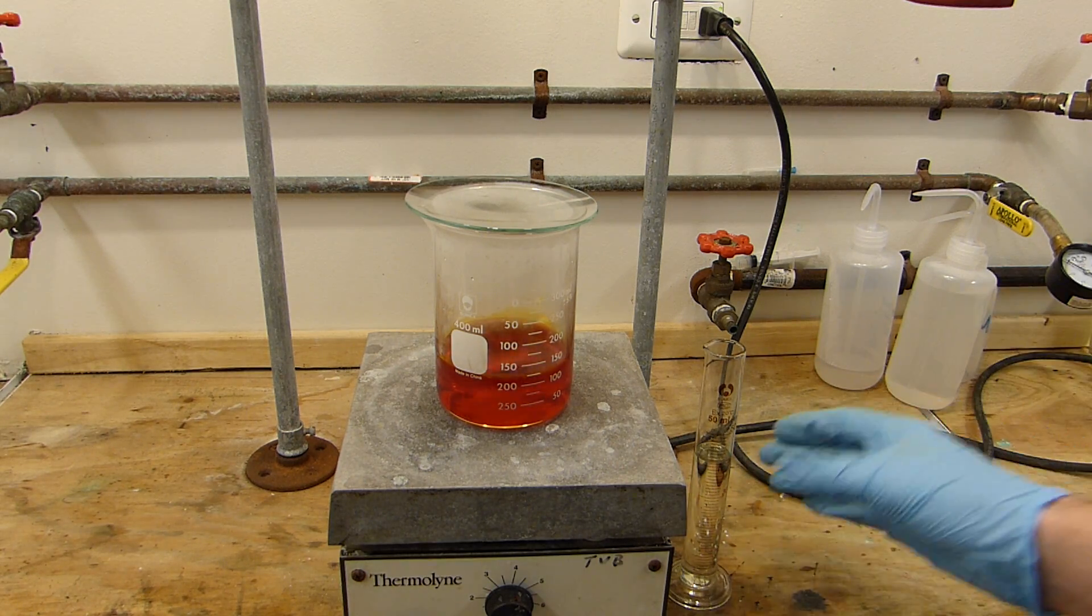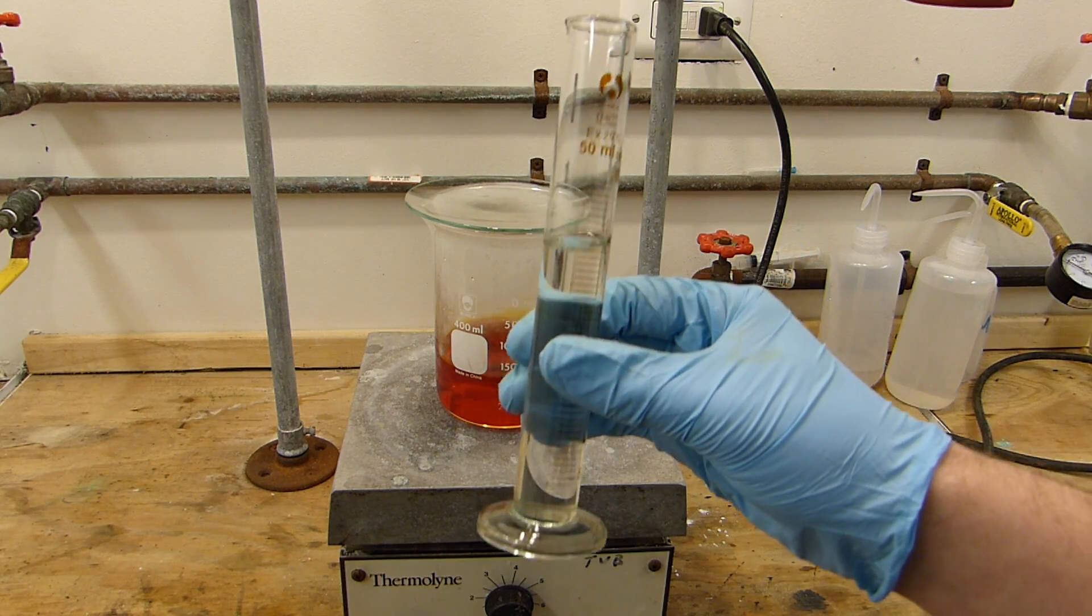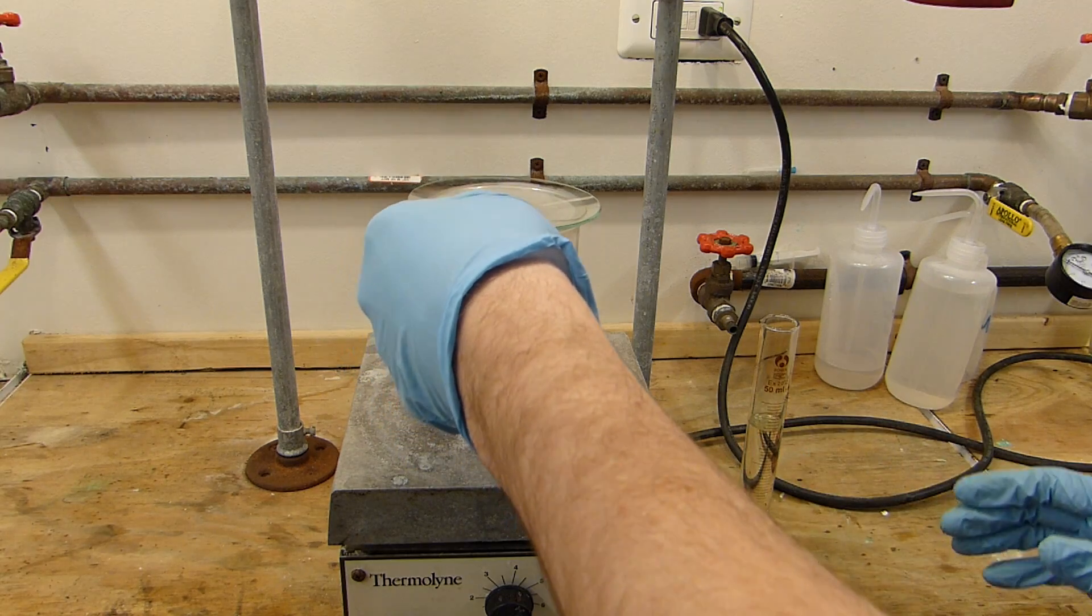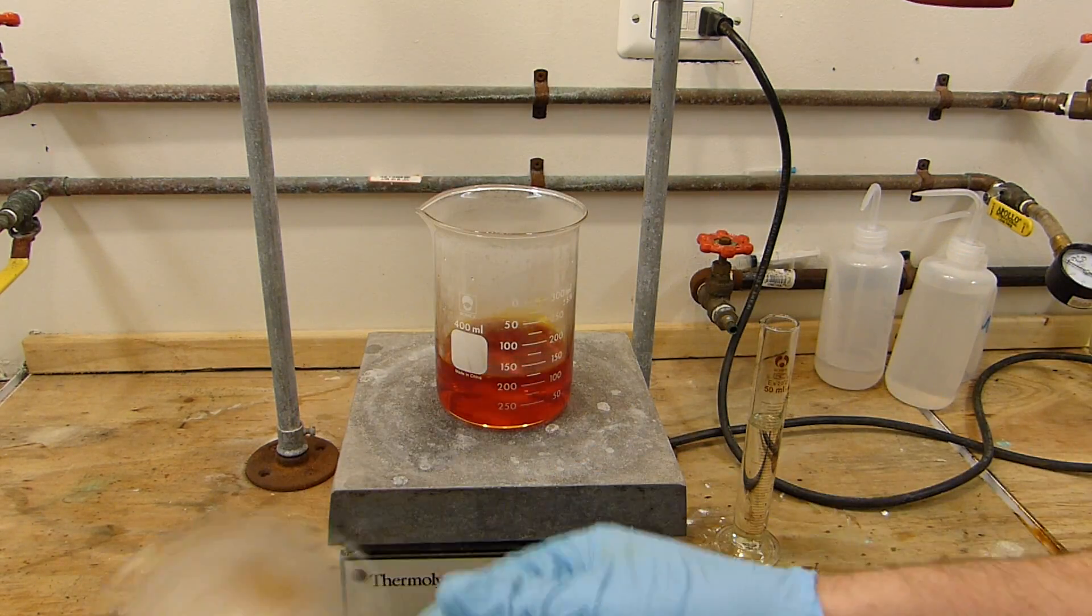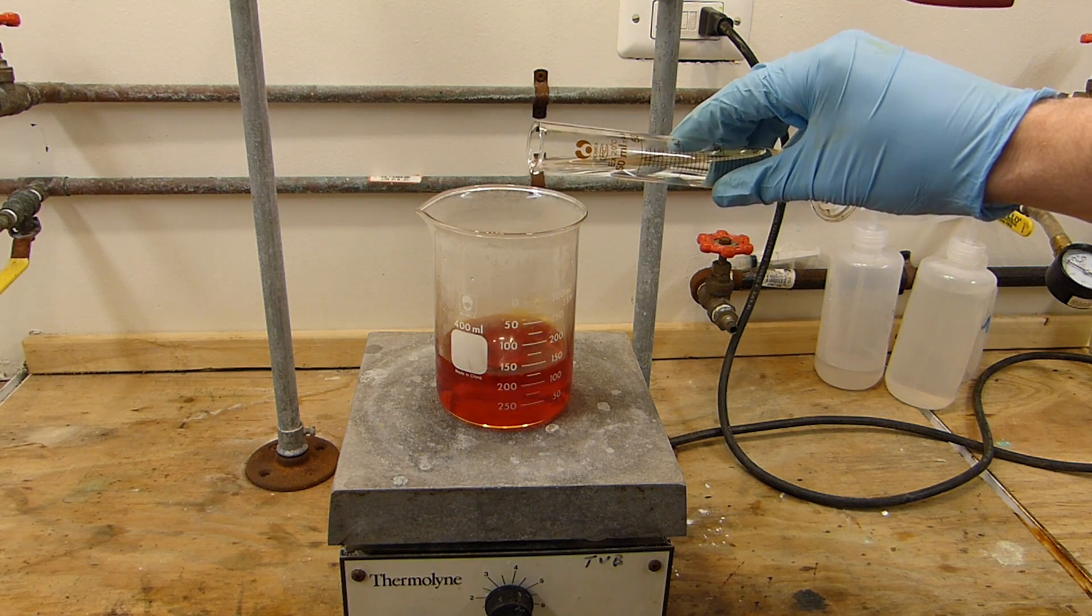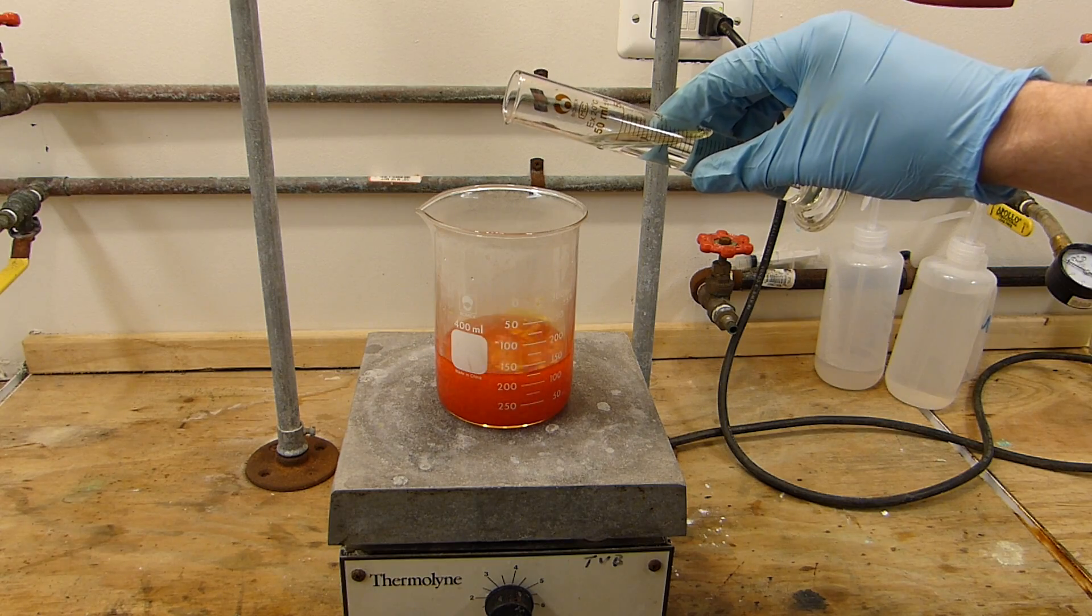And then to it over the course of about 10 minutes I'm going to add 40 milliliters of the pyridine I made in a previous video carefully and with rapid stirring. You can see the pyridinium chlorochromate precipitating.